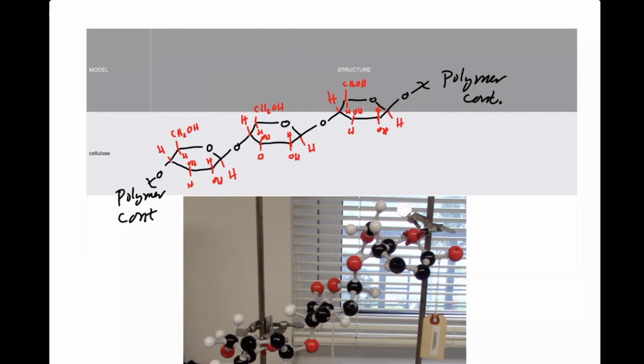Now, I get it, guys. This is crazy. These models are set up in the lab. Normally, students would have the chance to pick them up, look at them, examine them closely, ask questions about them. But unfortunately, because of the shutdown, this is what I decided to do to kind of help you all.